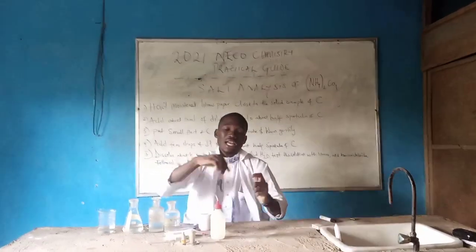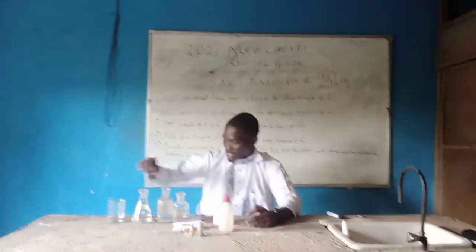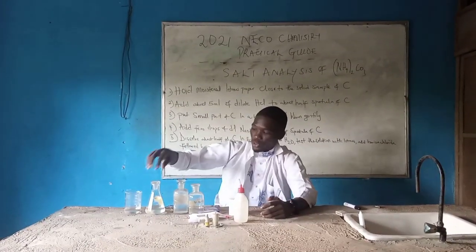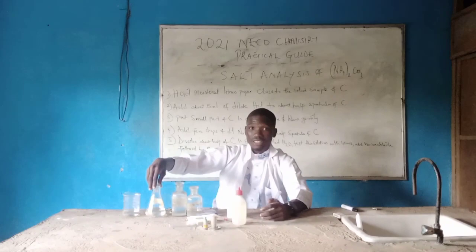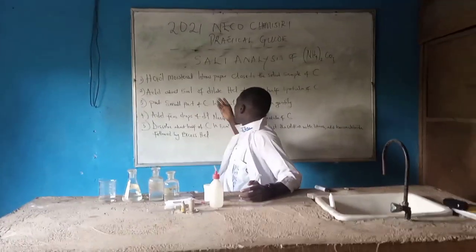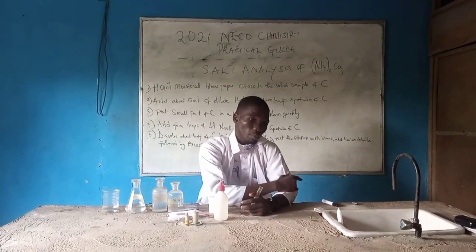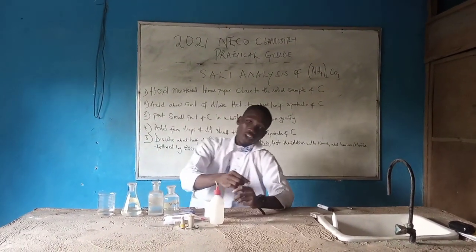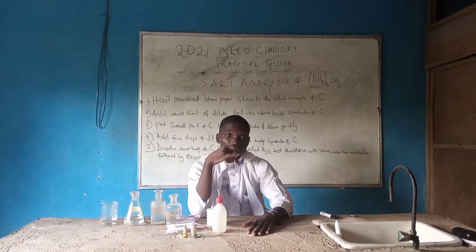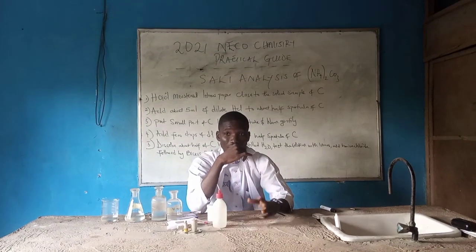The next thing to do is to pour this out and pick up another test tube. We are going to test sample C with sodium hydroxide. So: Sample C with sodium hydroxide. Because we are not provided with a Bunsen burner for warm water, I'm going to use a candle in place of the Bunsen burner. So now, when you pour your sample C into the test tube, add a little drop of dilute sodium hydroxide, then heat it.